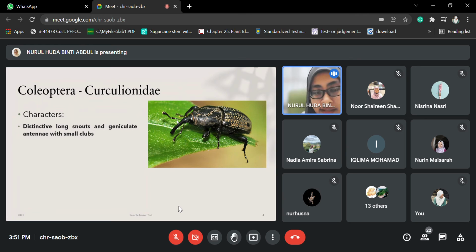Earlier your friend wanted to say something before the antenna. What is it? Nothing? The legs for crawling. Okay, legs for crawling, yes, it's true. But you can say other things about the legs as well.